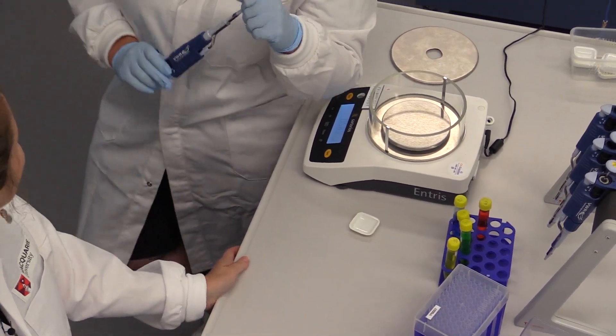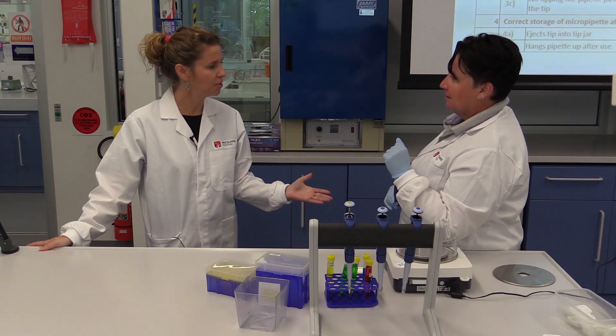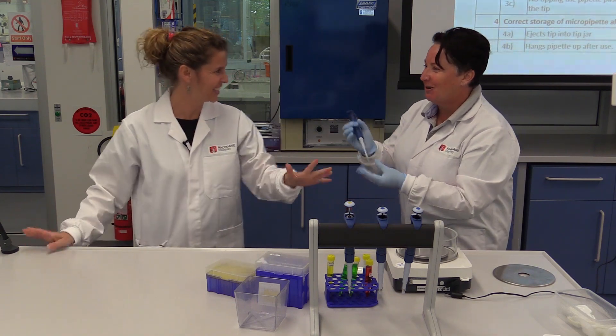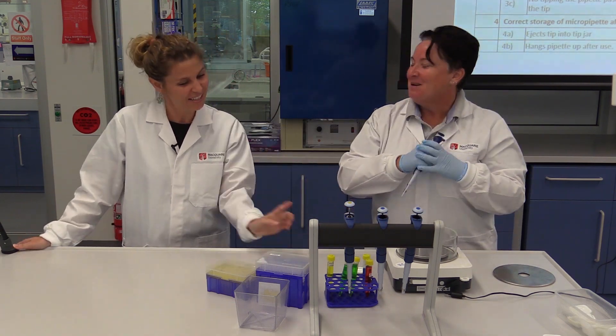Yellow. No, green. Green. Oh, my God. What are you doing with your tip? I don't know. Come on, you have to pipette. Whoops. Start again.